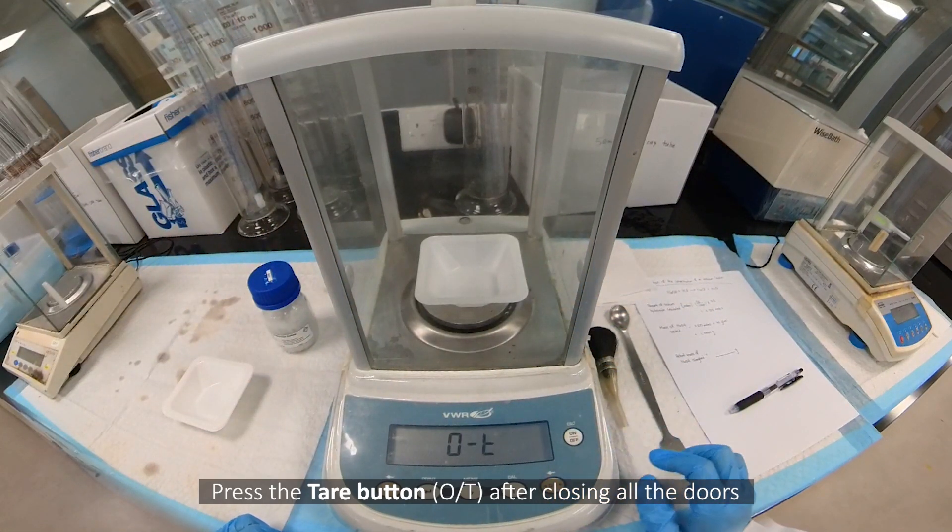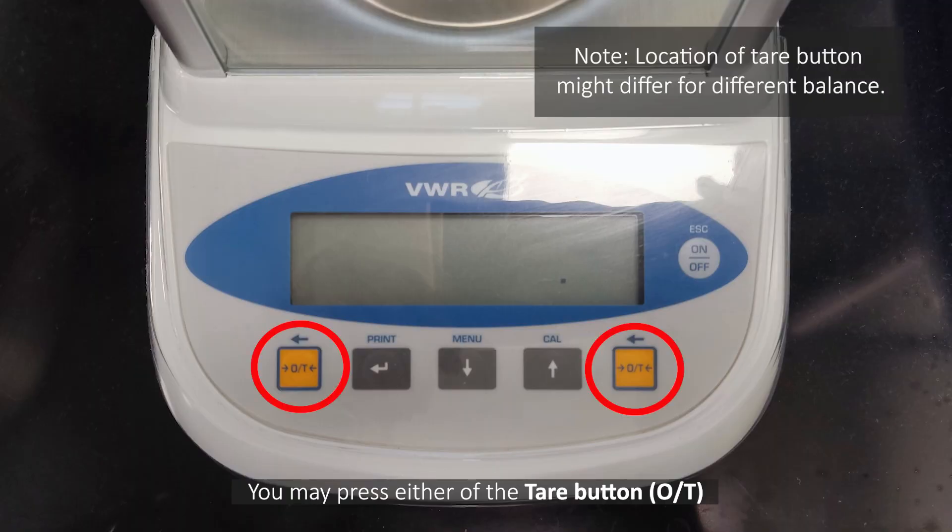Press the tare button after closing all the doors. You may press either one of the tare buttons.